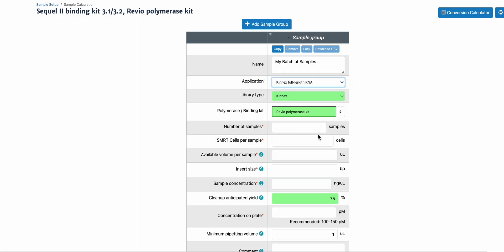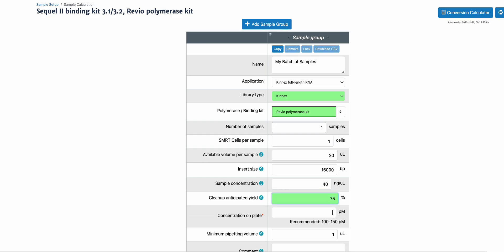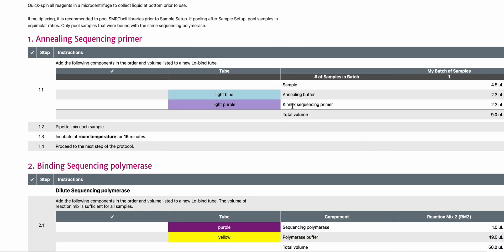Let's select full-length RNA as an example. All Kinex kits will have the library type Kinex as opposed to standard. You'll see that it recommends the Kinex sequencing primer with a light purple cap. All Kinex libraries should be sequenced with the Kinex sequencing primer.